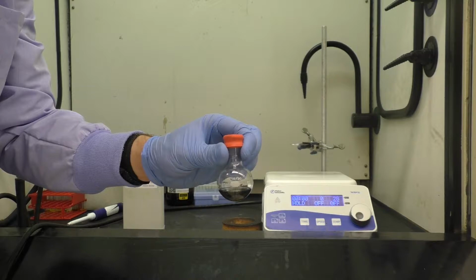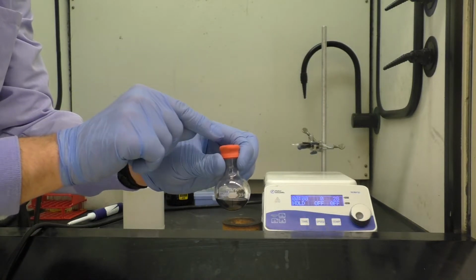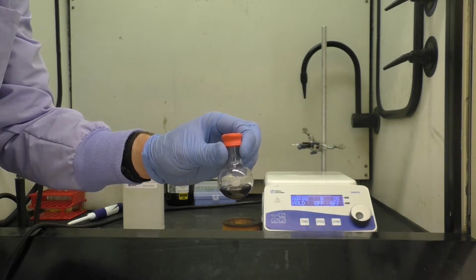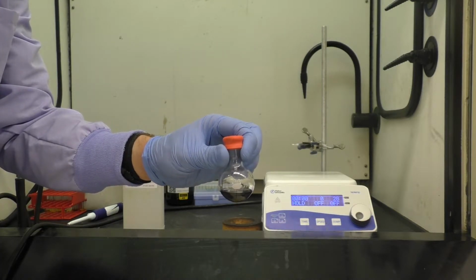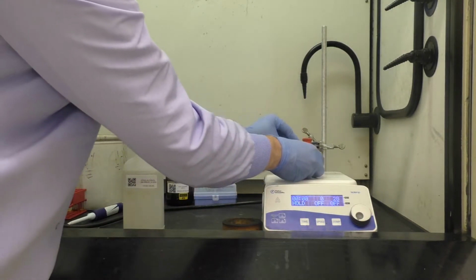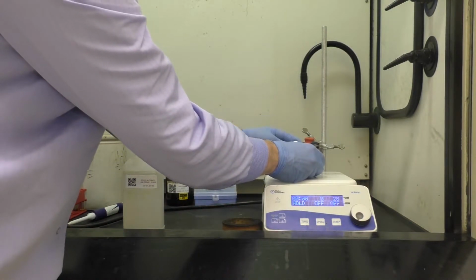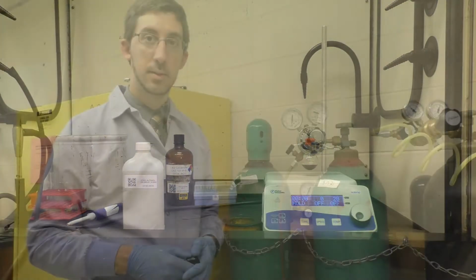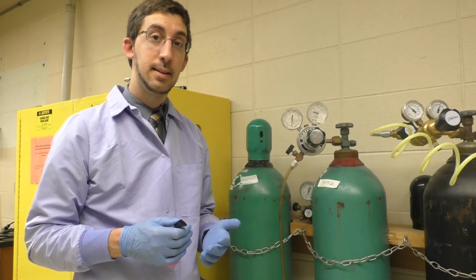Now, after I get a balloon of hydrogen, I will be able to add it through the top of the septum with a needle so that it will place this under a hydrogen atmosphere for the reaction. And then we can begin the stirring. So we're all ready to get some hydrogen now.